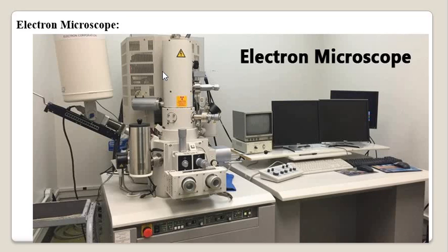For the observation of objects under the compound or light microscope, a different procedure is there, and for observation under the electron microscope, a different protocol is there, right?